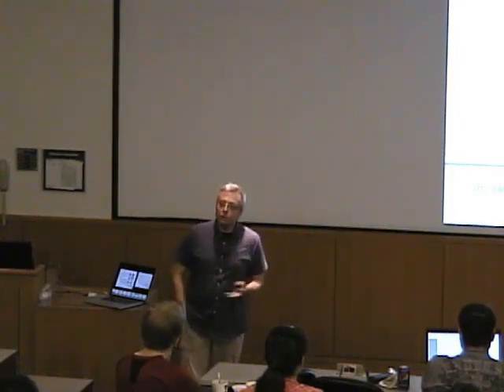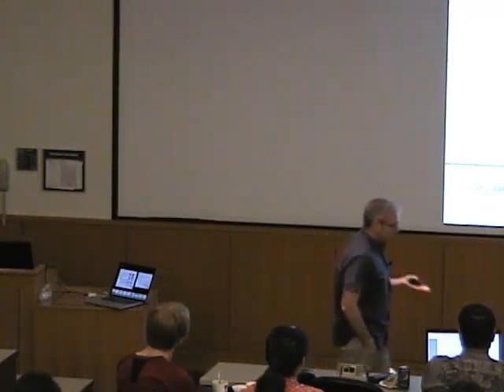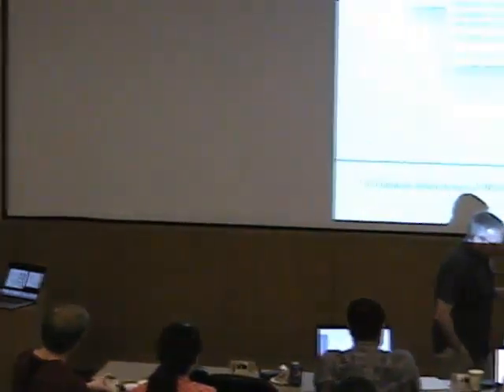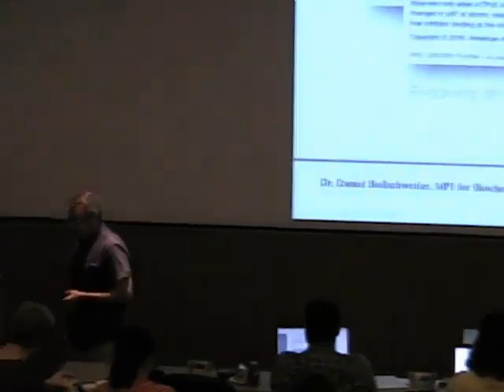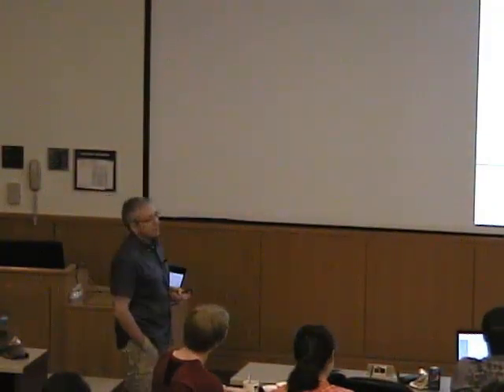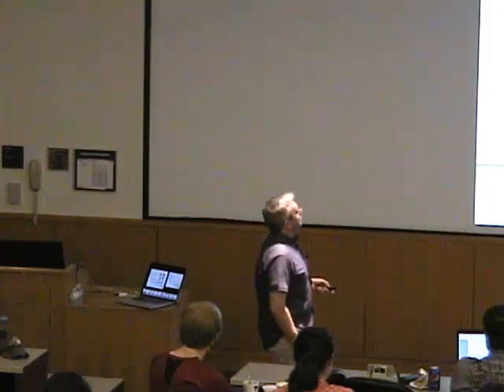So why are we not all doing X-ray crystallography? Why are we not all doing electron microscopy, of course? One reason is that the instruments are slightly highly priced. For what I showed you, the Krios, you would pay probably something like 5 to 6 million, plus an annual service contract. That's pretty much of a killer. So you could buy around 50 X-ray diffractometers for that. Nobody needs 50 X-ray diffractometers, but you get the picture.